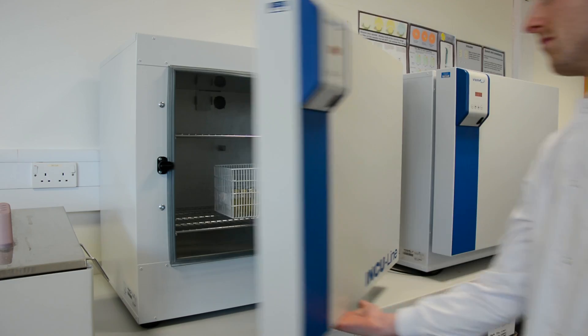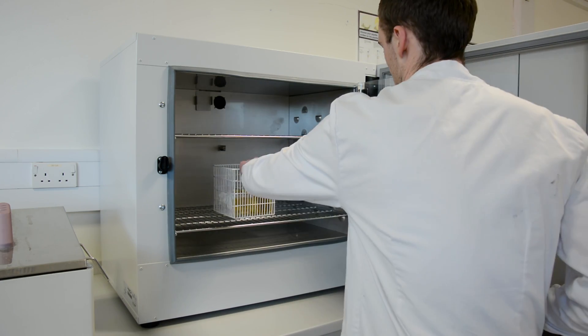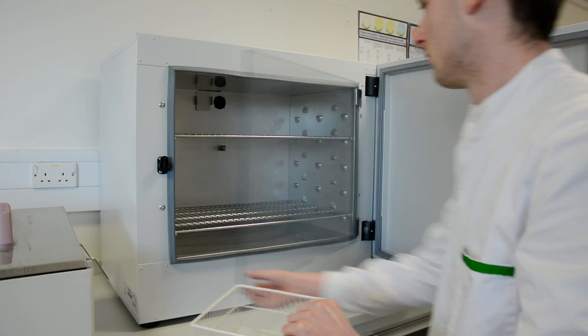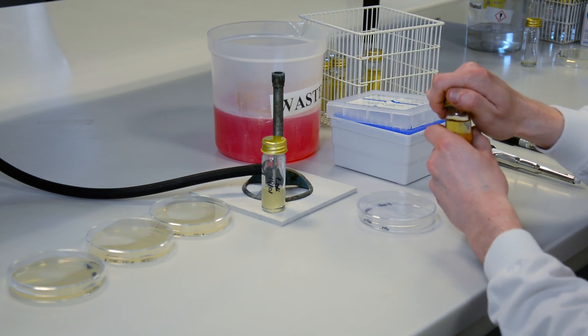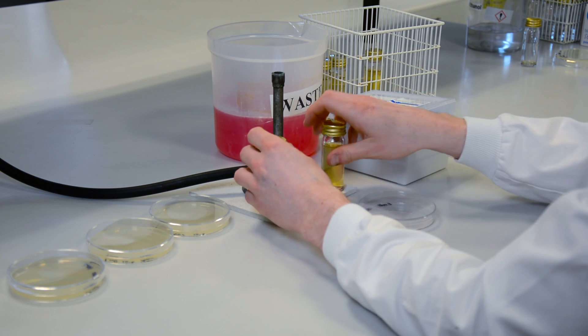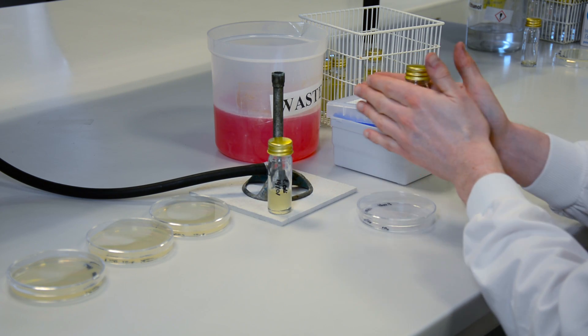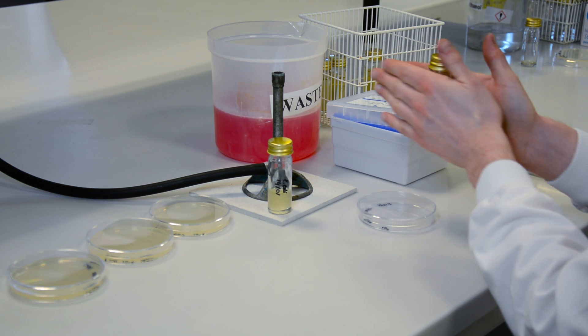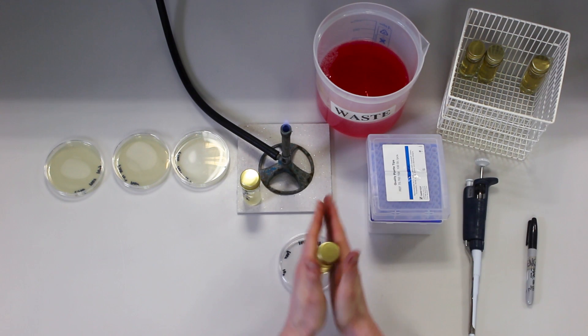When you are ready, remove the molten agar from the incubator or water bath and allow it to cool a little further. You can roll the bottles in your hand to gauge the temperature. It is the right temperature once it is just comfortable to hold. Too hot and it will kill the inoculum. Too cold and it will start to set in the bottle.